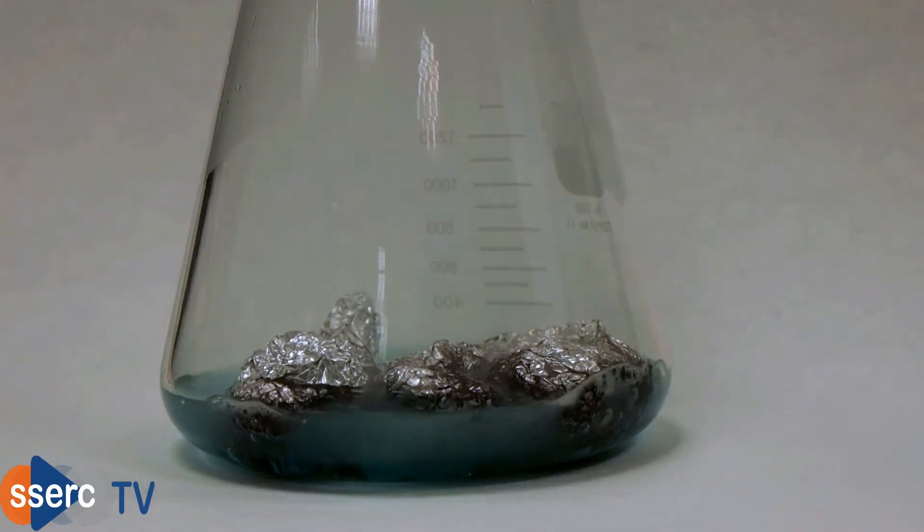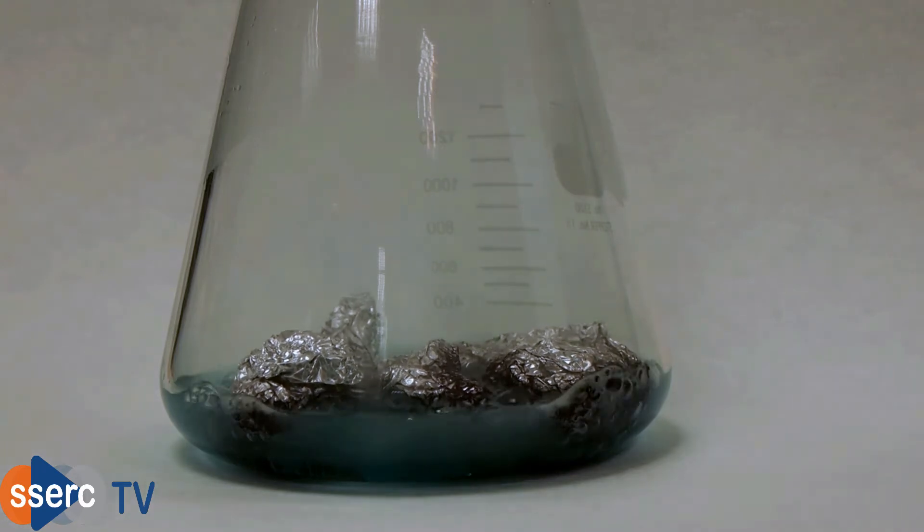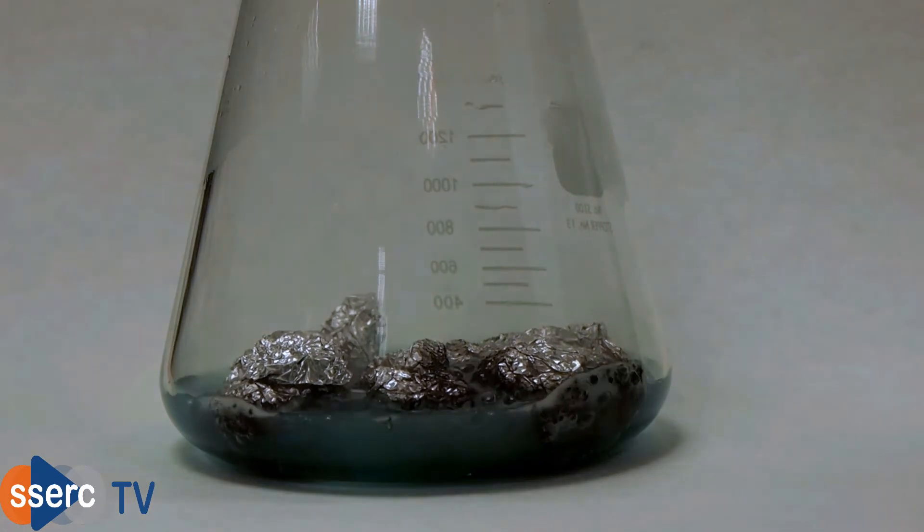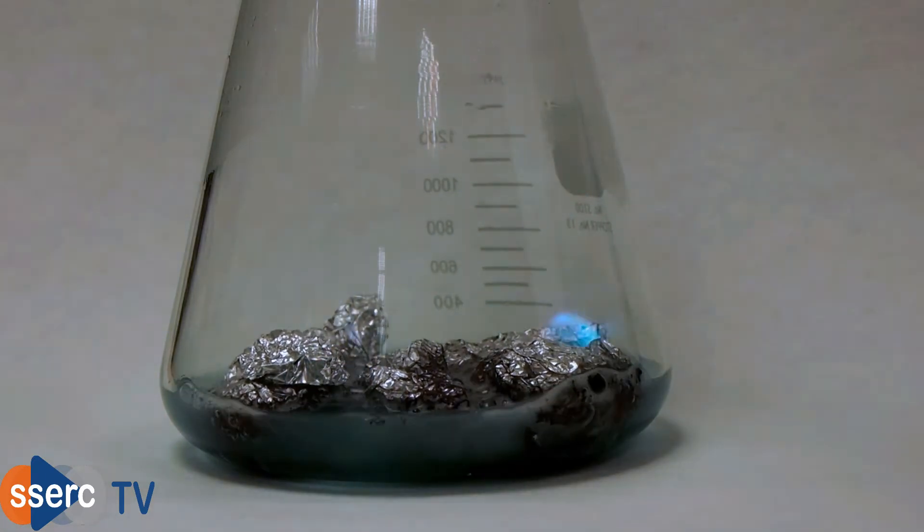We leave it for 30 seconds or so and then apply a lit splint to the top of the flask. There is a pop and you'll see a blue-green flame dancing over the bubbling metal.